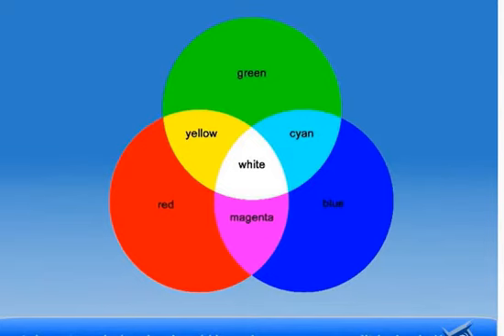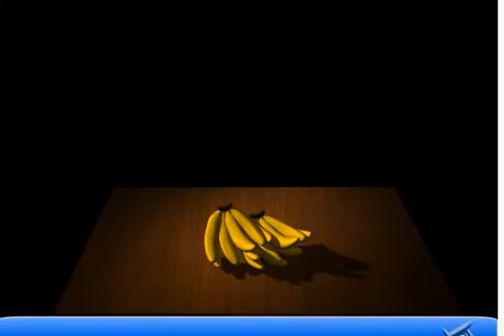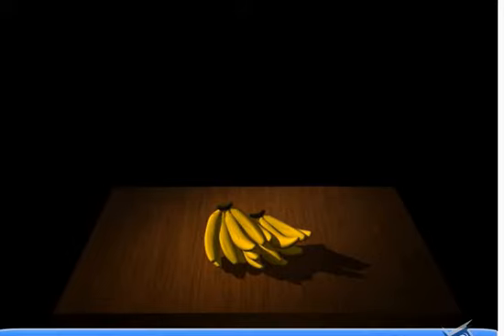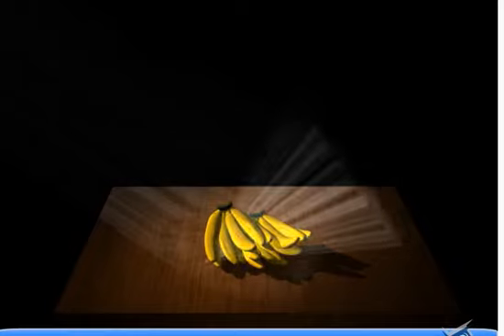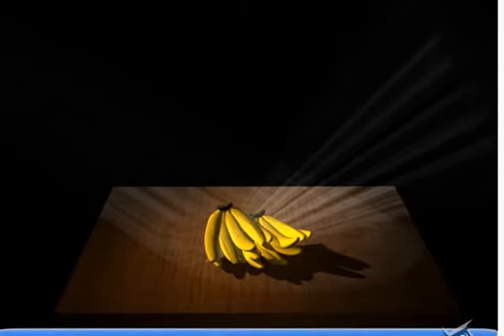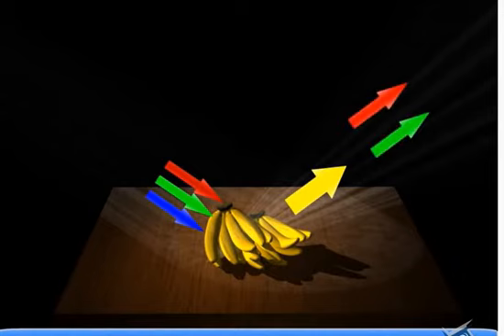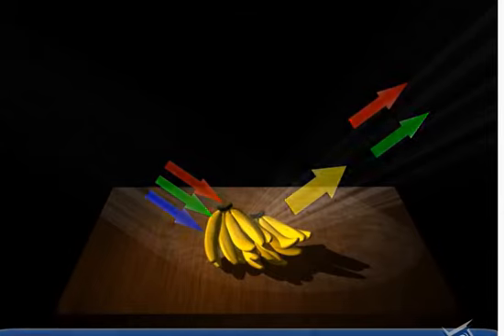On the red, blue, and green components of light absorbed by the object or sample, much as the human eye does. For example, consider bananas. When white light hits the bananas, all the colors are absorbed except for yellow. The yellow light reflects back and hits our eyes, so we perceive the banana to be yellow. The yellow light that the bananas reflected was really a combination of red light and green light.